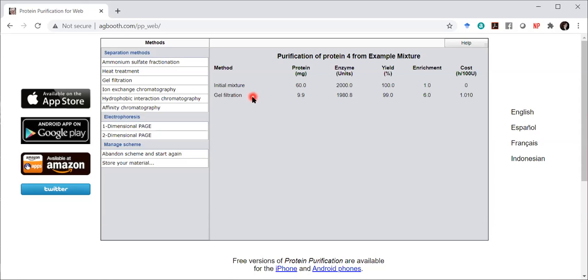You would need to tell me which kind of gel filtration you did and which fractions you took. All of that needs to go in your report. So watch out. We're not really keeping a lab notebook in the traditional sense for this exercise, but you do need to write down what you're doing, or else when it gets to be lab report time, you're going to have to do it all again.